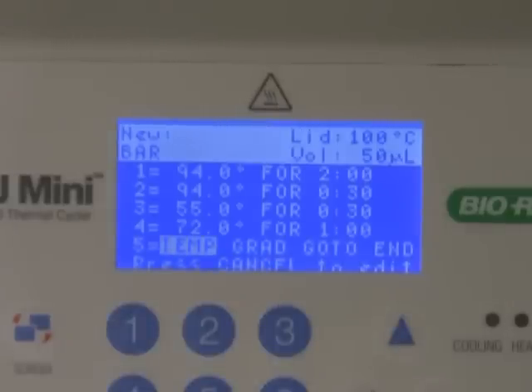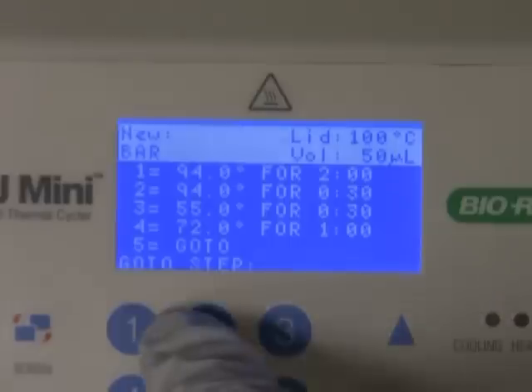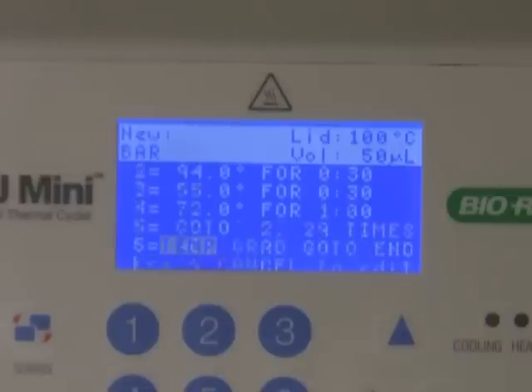During step 5, we'll tell our program to go back to step 2 and repeat steps 2, 3 and 4 for another 29 times. So in total we have 30 cycles. Step 6 is 72 degrees for 5 minutes. During this step, polymerase will finish amplification of whatever fragments were left not completely amplified.